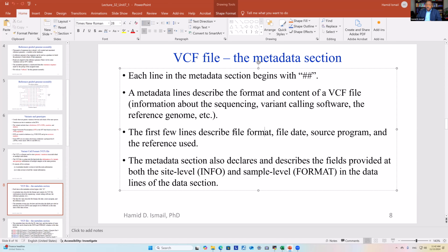But for now 38 is the most stable one, very well annotated, and scientists put in a lot of effort to annotate this genome with different kinds of annotation. So of course, I cannot just trash those annotations like that. So we are still using that one.